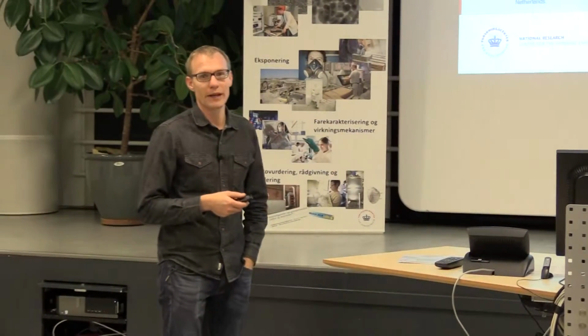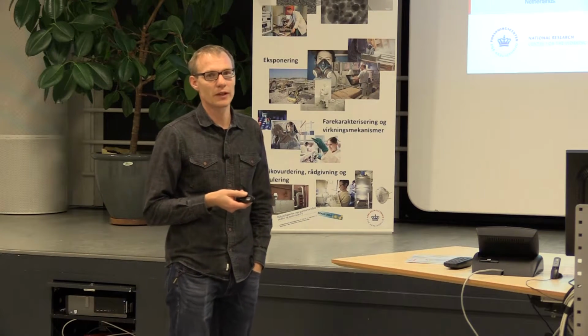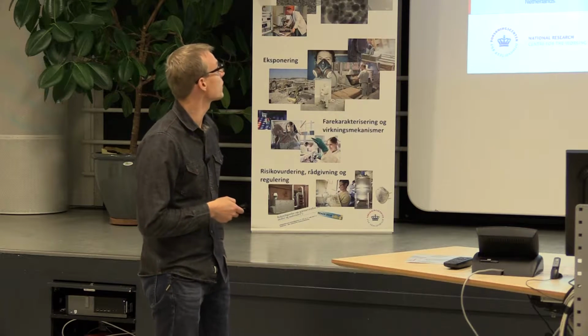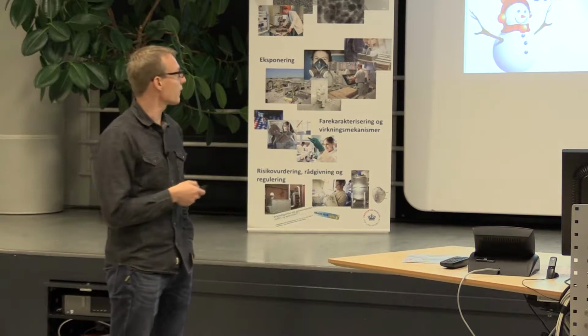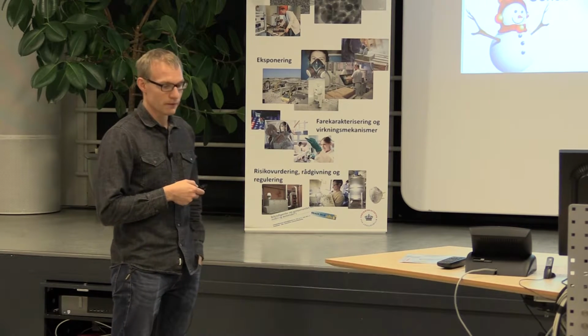There are many kinds of handheld instruments, like condensation particle counters, optical counters, and diffusion chargers. Today I will talk mainly about diffusion chargers, which measure lung deposited surface area. I'll show what kind of lung deposited surface area concentrations we measured in different occupational settings, and then we use these concentrations to calculate inhaled lung deposited surface area doses.